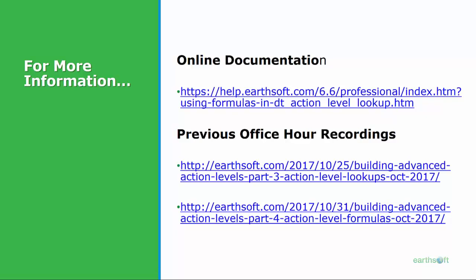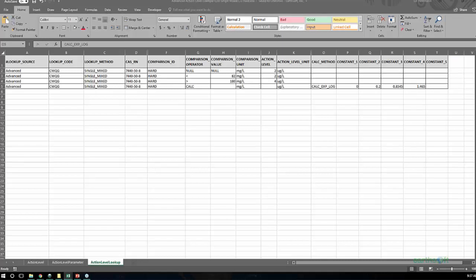the constraints in the agency guidance don't always have a less than and greater than value. And so the order is how, you say, won't EQuIS stop at the value if hardness is between 82 and 180? I mean, it doesn't know what the hardness value is less than or greater than until it steps through those steps.